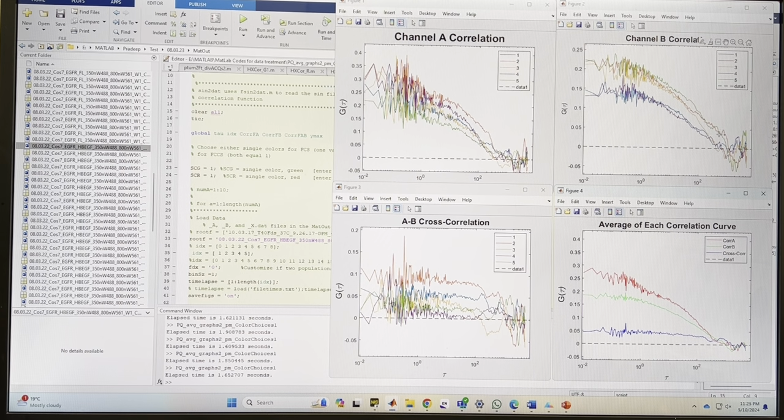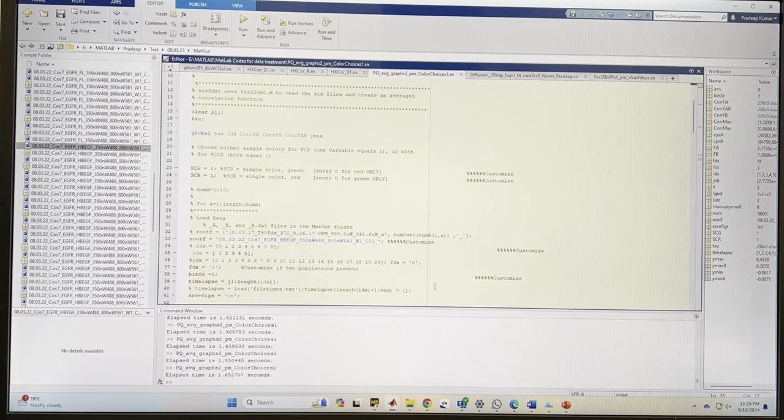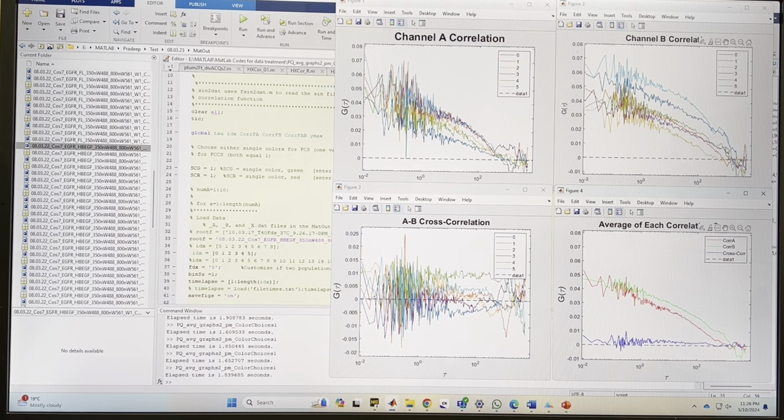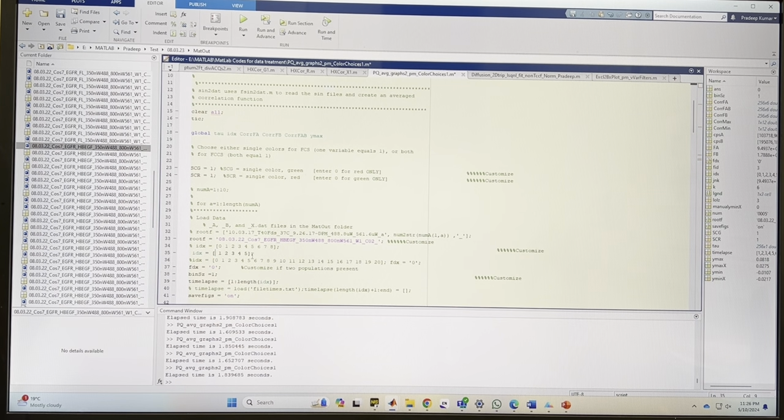Now all of them are going a little bit, but mostly looking the same way. So the diffusion profile is looking pretty good here. And then I'll go here, Control G, so all 6 points will come back, and then I'll change here to cell number 2, and then F5. So I see here 2 of them are looking out of shape. One is 0, another is 5. So I'll remove 0 and 5, and then F5.